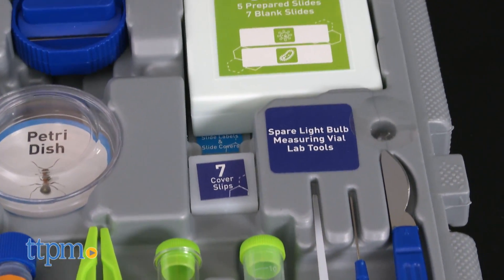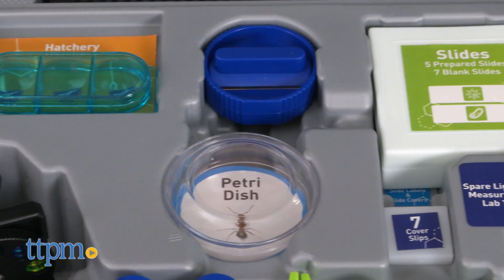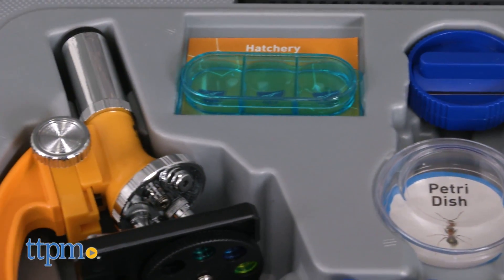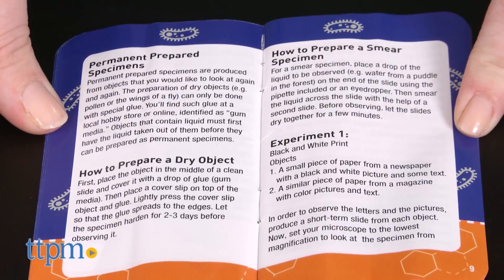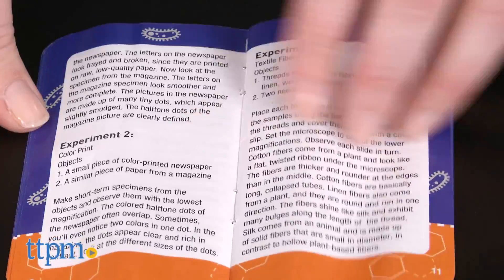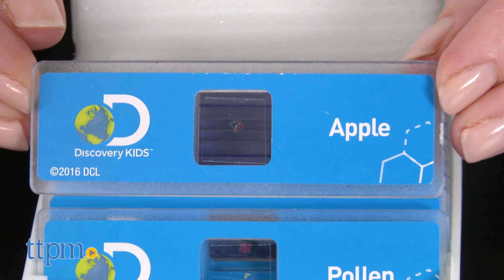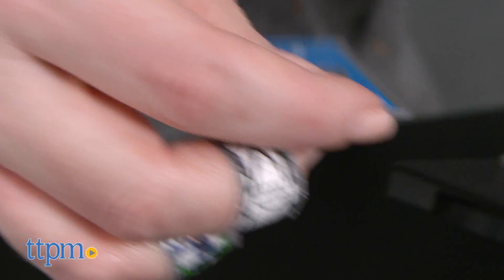The experiment booklet offers tips for how to use the tools in the kit, and then guides kids through the experiments for observing different objects — from black and white print to textile fabrics, and then getting a little more in-depth with growing and observing salt crystals and brine shrimp. This is for ages 8 and up, but some of the experiments require adult supervision, as well as other tools that you'll need to provide from home.